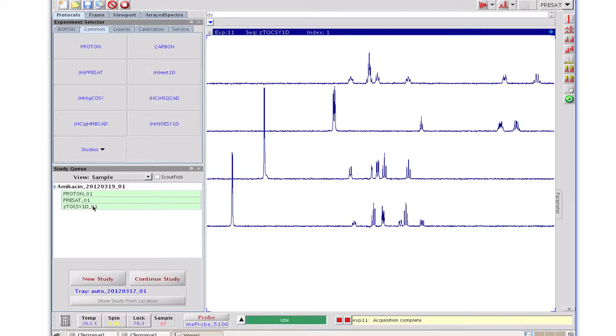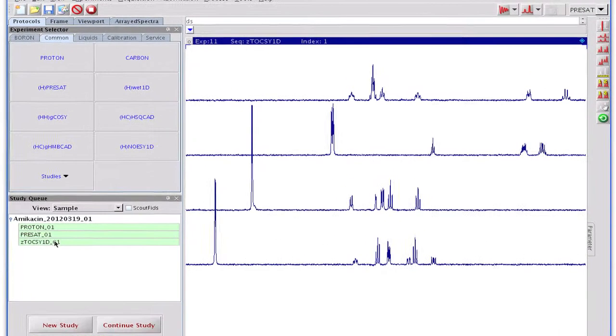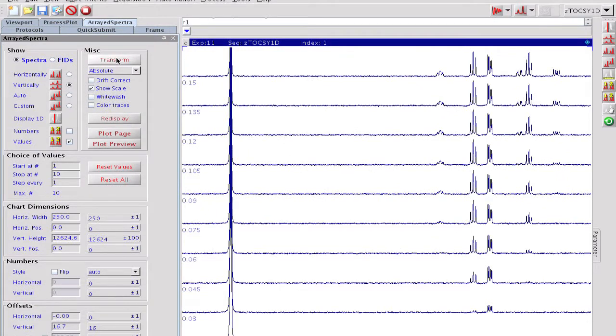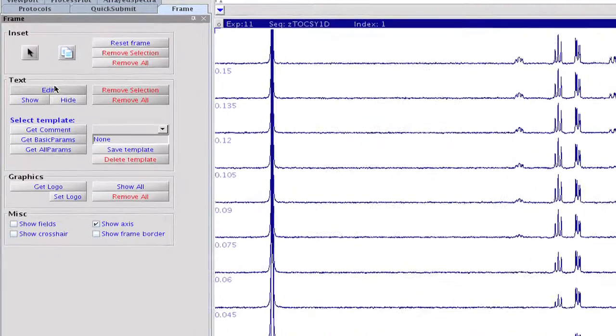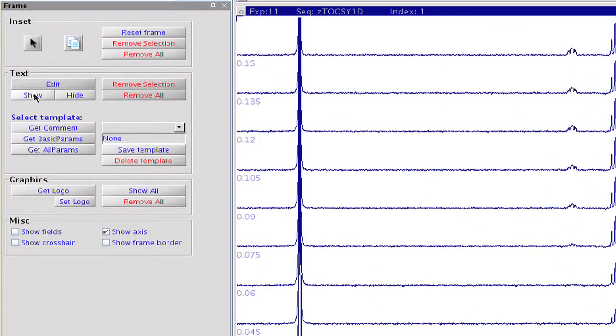We load this FID into the workspace and take a quick look at the results. As the mixing time increases, the magnetization relays further and further in the sugar ring. The order of signal appearance allows us to make unambiguous signal assignment within this ring.